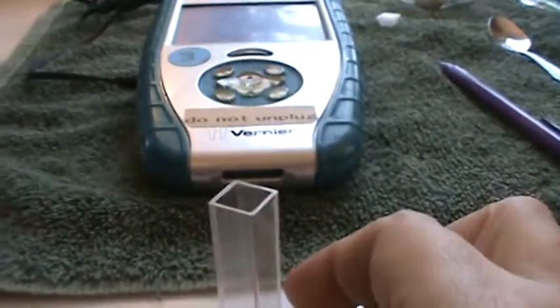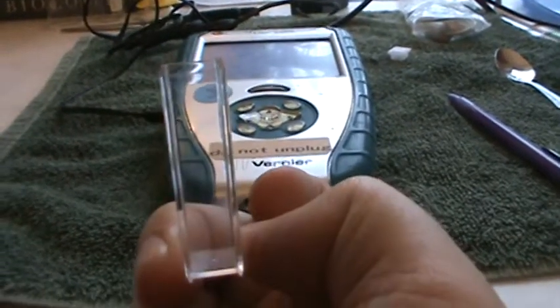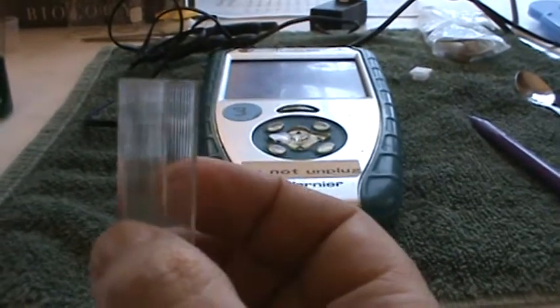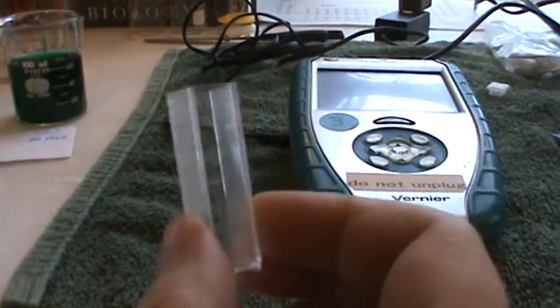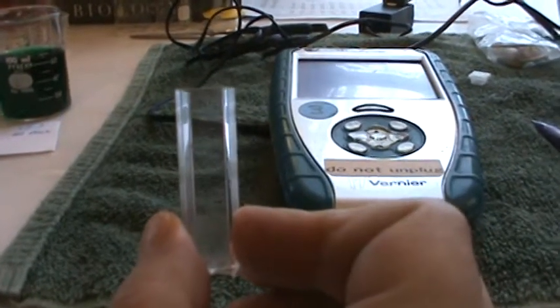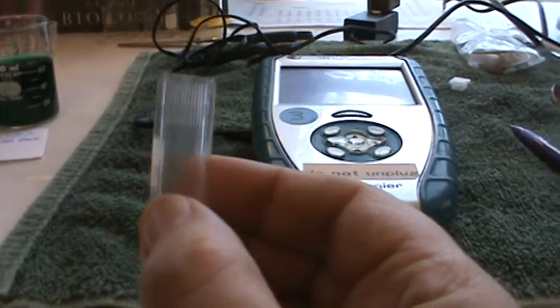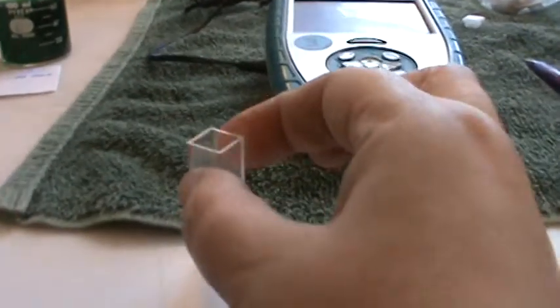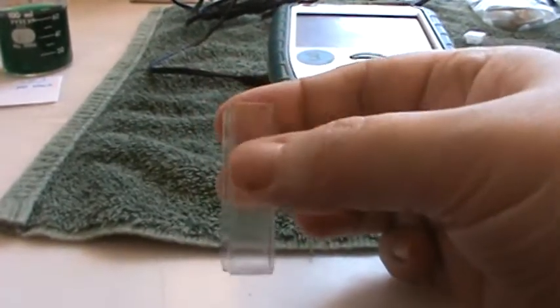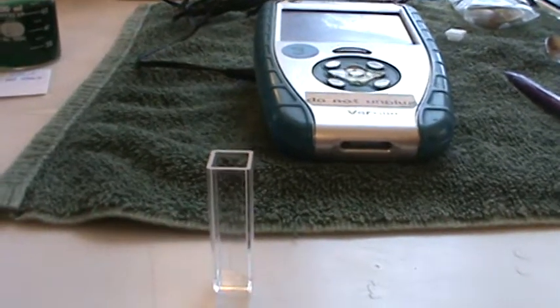Let me see if I can get a good view of it. This is called a cuvette. C-U-V-E-T-T-E, cuvette. You don't need to know how to spell that, but this is called a cuvette. And look, on this side, the sides are smooth and you can see straight through it. And that's the side that the light is going to pass through. And then on this side, you can see that the side is serrated or almost prismatic. And that's so that you can get a good hold on this side, the serrated or prismatic side, because it's textured, and then not put any fingerprints on this side.